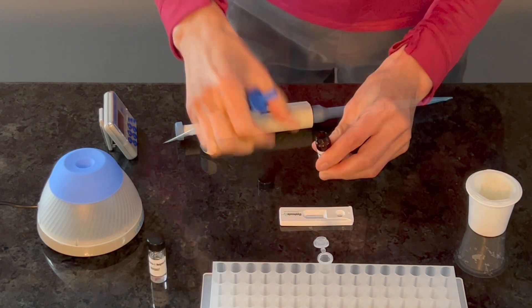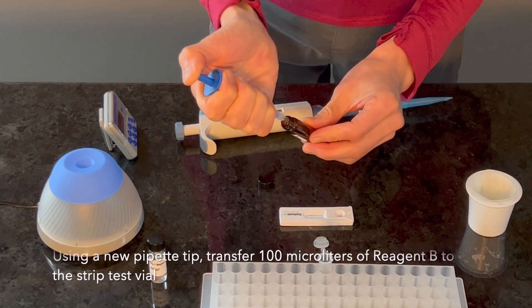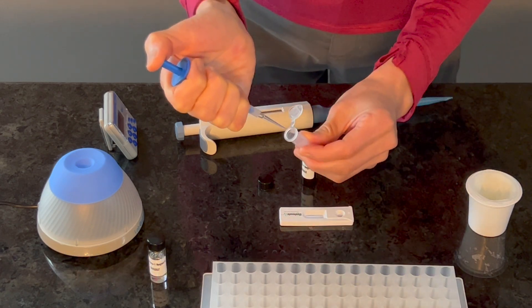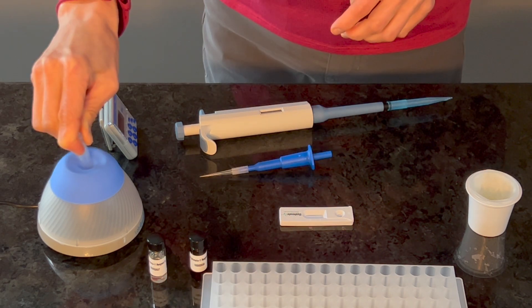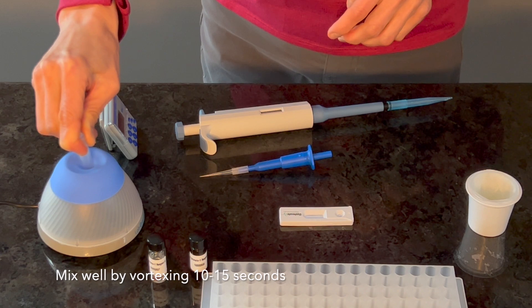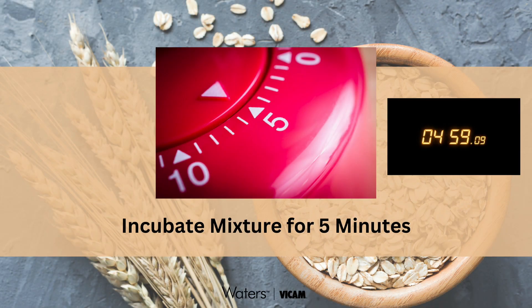Pipette 100 microliters of Reagent B into the same vial containing the sample and Reagent A. Close the lid and mix well by vortexing for 10 to 15 seconds. Allow 5 minutes for this mixture to react.